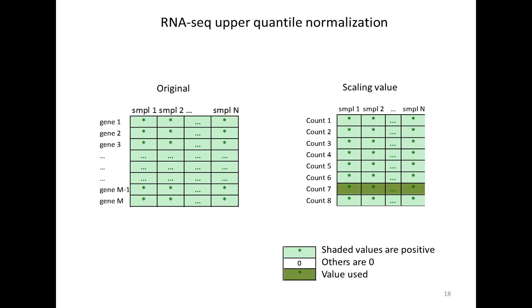But so with RNA-seq data, there's a number of different normalization methods. I would define normalization in two ways. There's either scaling normalization, where you divide by a single value, or there's global transformation. An example of scaling normalization is where you divide by the column sums, so you would get proportions. So you divide by the library sizes, okay? And that would give you the relative abundance. Everybody in the microbiome is reporting relative abundance for different communities, and it's important to do that.